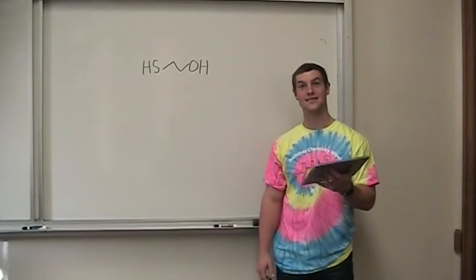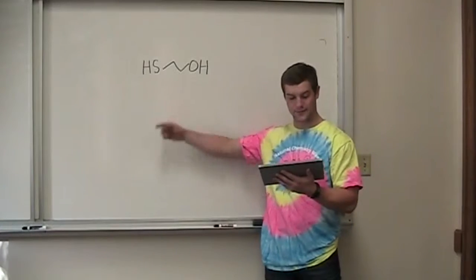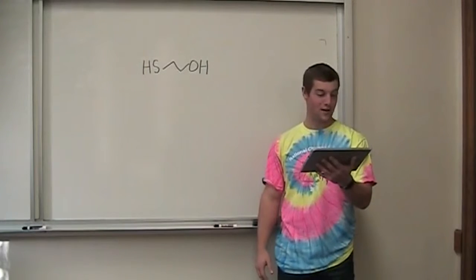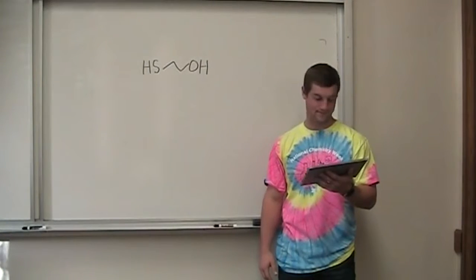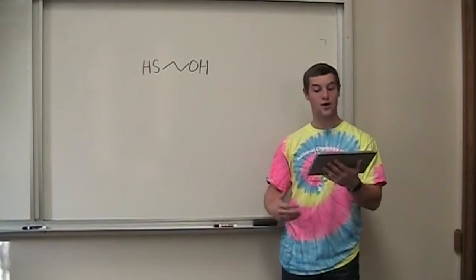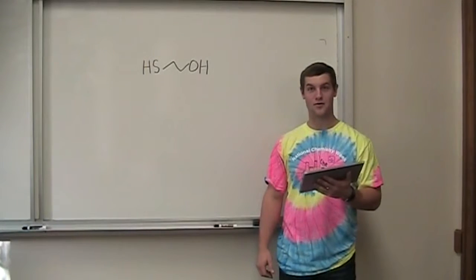Beta-mercaptoethanol, or BME as it is commonly abbreviated, is the chemical compound with this formula you see here. This molecule is used to reduce disulfide bonds. The disulfide bonds are strong with a typical dissociation energy of 251 kilojoules per mole. However, being about 40% weaker than carbon-to-carbon bonds or carbon-to-hydrogen bonds, the disulfide bond is often a weak link between many subunits of several molecules.